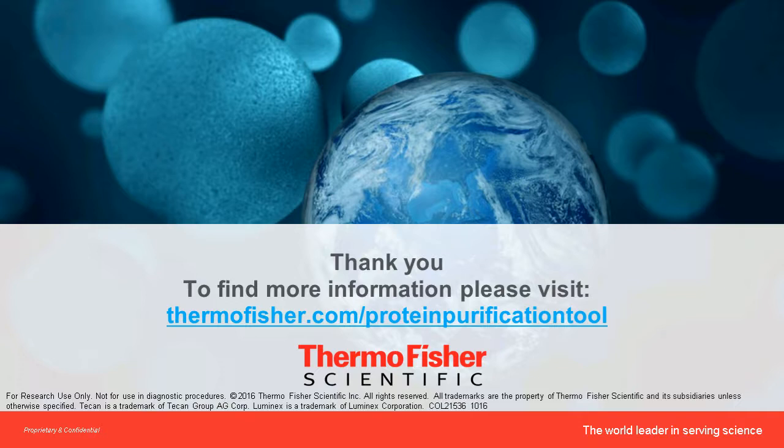Excellent. Thanks, Bhavin. And our next question asks, do you see interacting proteins in these IP experiments? Yes, we do see interacting proteins in IP experiments. However, based on the wash buffer that you use, a lot of times interacting proteins wash out because of the stringency of the wash buffer.